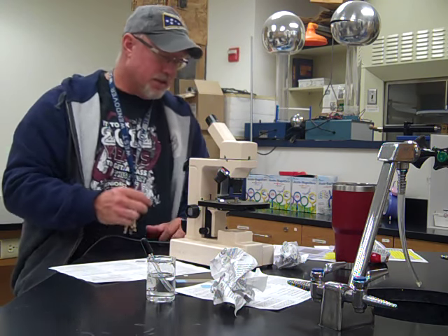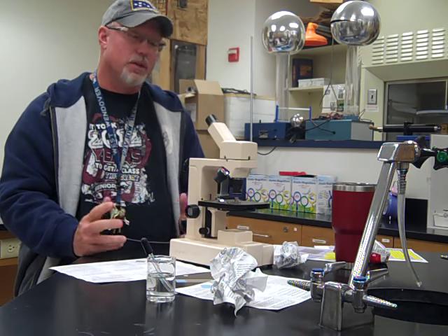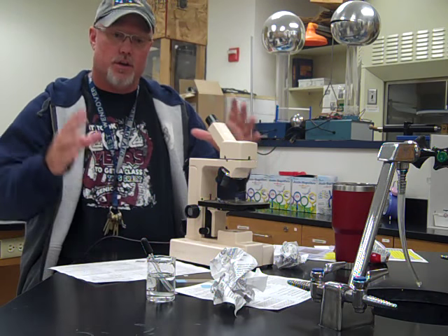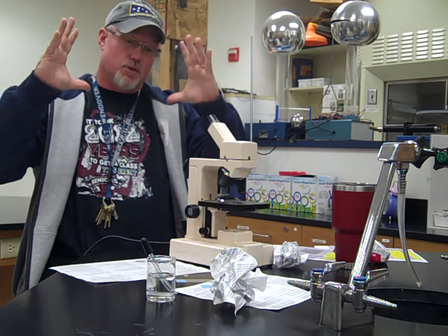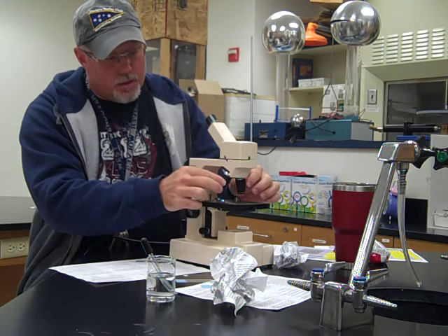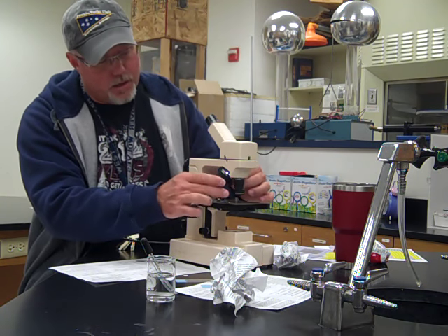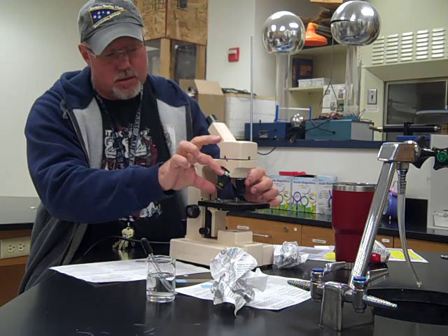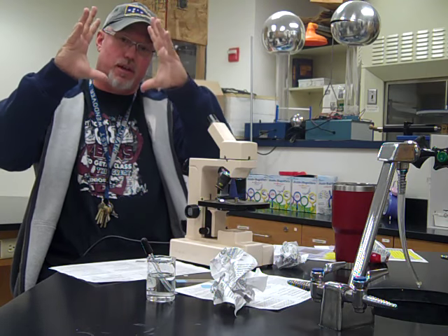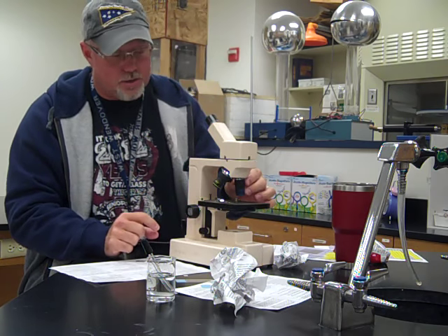The objectives are the next thing. There are 3 of them. Some microscopes only have 2, but for the majority of what we're using, it's going to be 3. The smallest one here is the lowest power. Your field of view is very wide, so your objects aren't very magnified, and you're going to see a lot of stuff in your field of view. By the way, the lowest one is usually colored red. The middle one magnifies a little bit more, so your field of view gets smaller and your objects start to look bigger. Look for the yellow color.